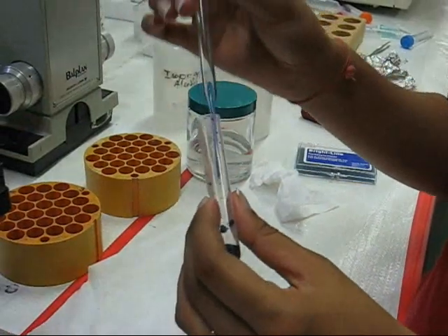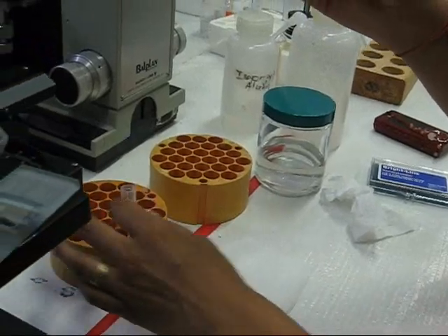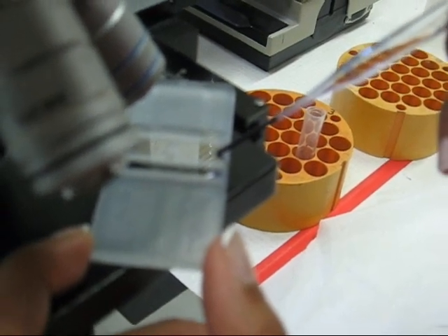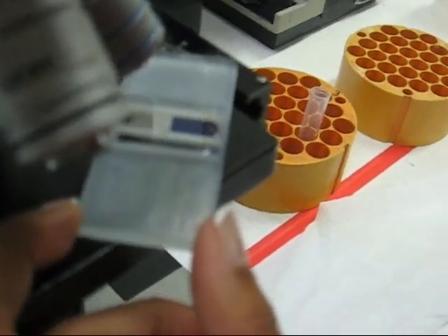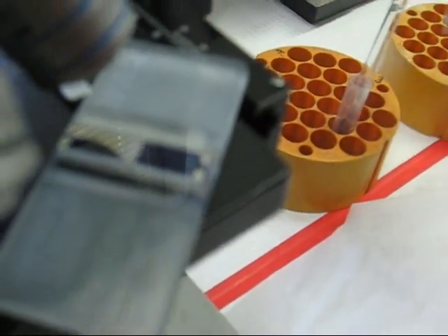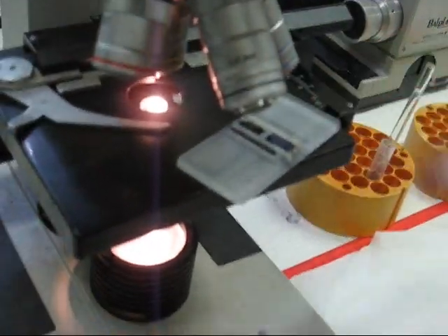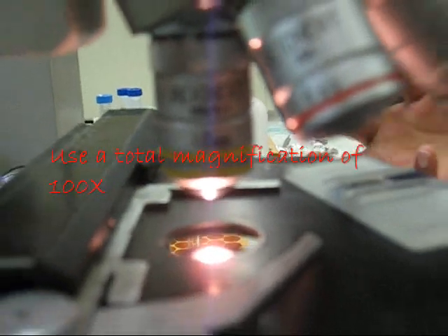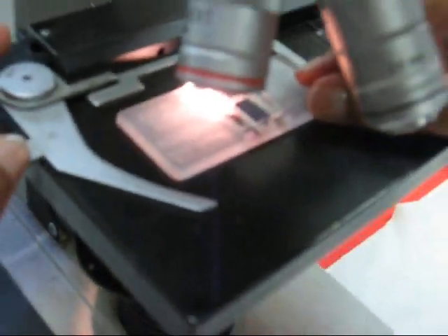Then carefully take some up into the pipette and, starting at about a 20 degree angle, move up to 40 degrees until the entire square is filled up with the solution. Then turn the microscope on, make sure it is on the correct magnification, and place the slide under the microscope.